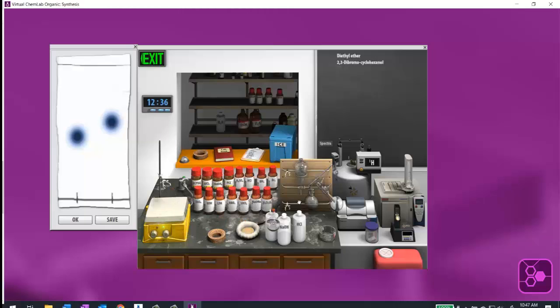It will tell you what you've made, so it's a little simpler than guessing. And then we can purify it and extract it. So I can just grab my separatory funnel and put it next to it. I can then separate that, so you don't get the true experience of the actual separation method, but that's the idea. When we're done, we get our product.